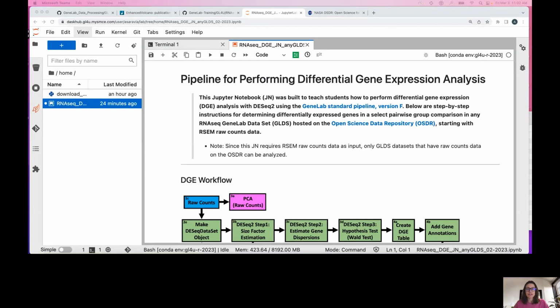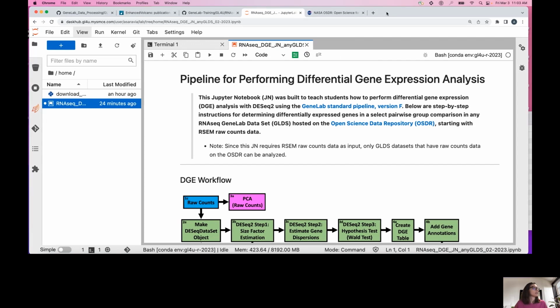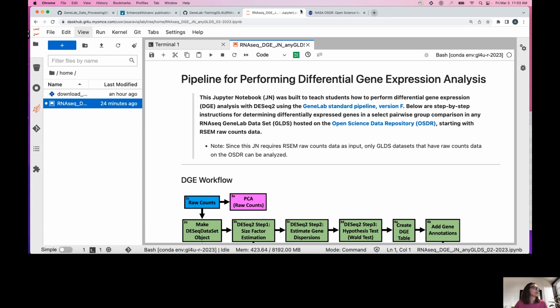Yep, it's already in SMCE. I'm going to have you guys walk through it with me as I go. We'll go fairly quickly unless you have any questions, because I know you went over a lot of this stuff last semester. First, can you guys see my screen? Yes. Okay, awesome. Let's start with you logging into SMCE. I'm already logged in.